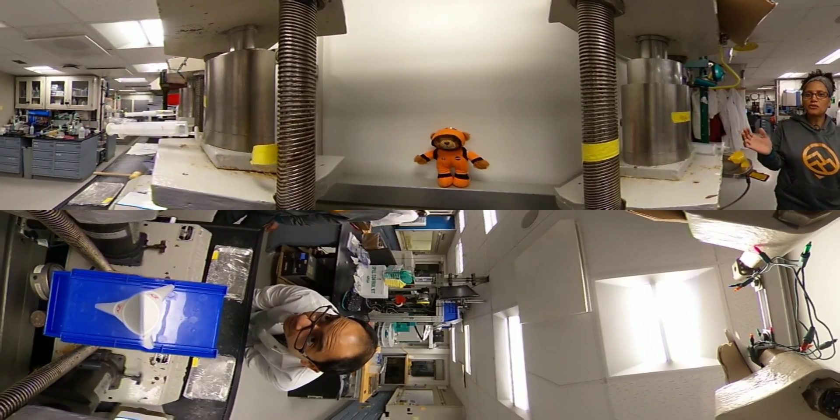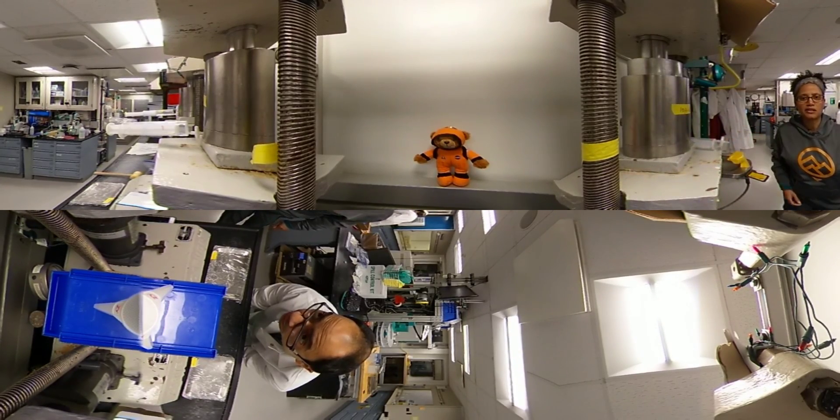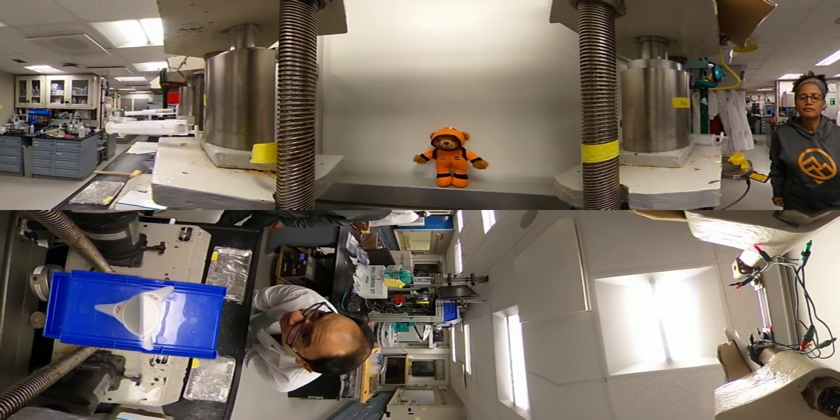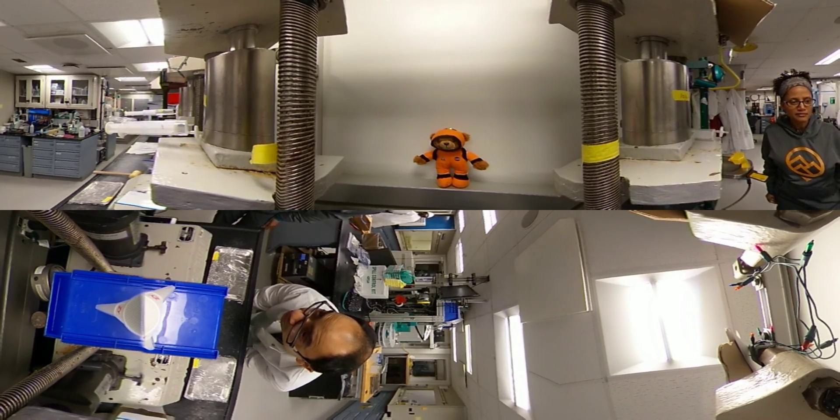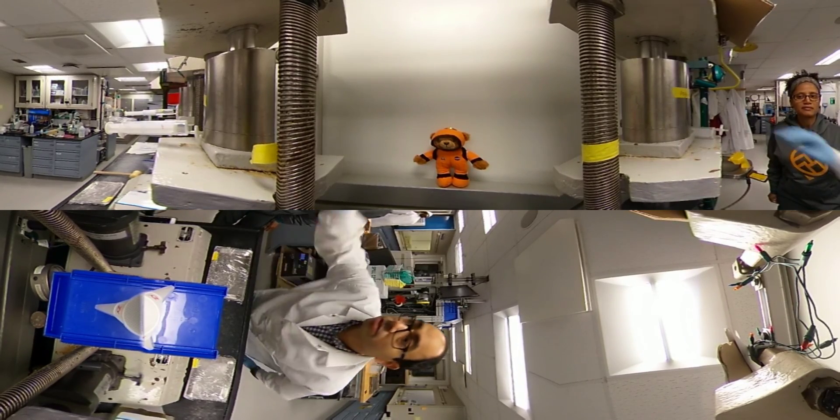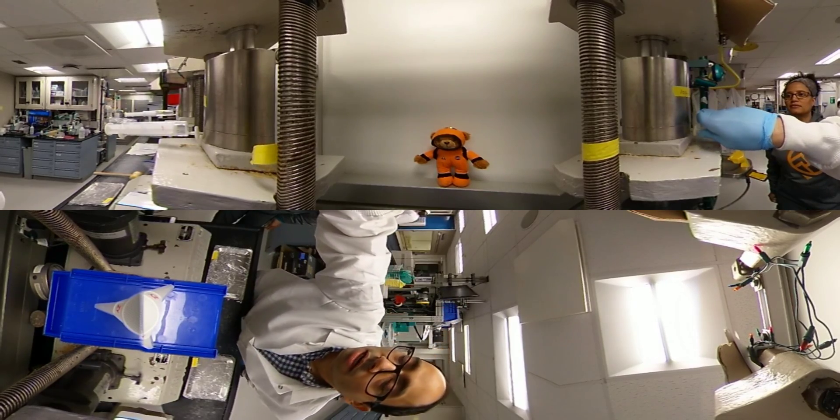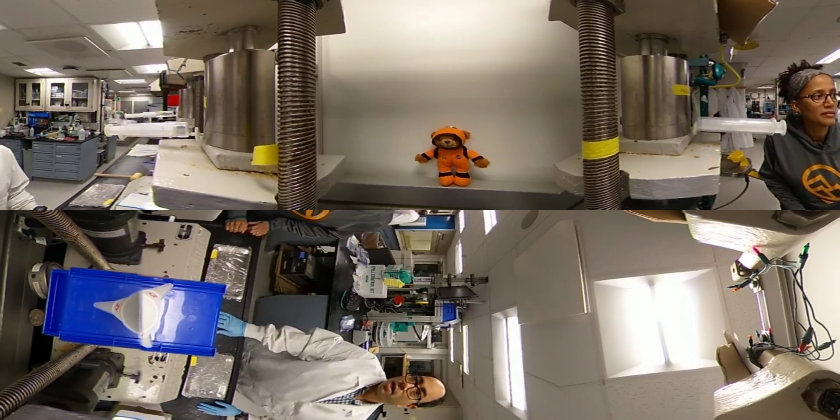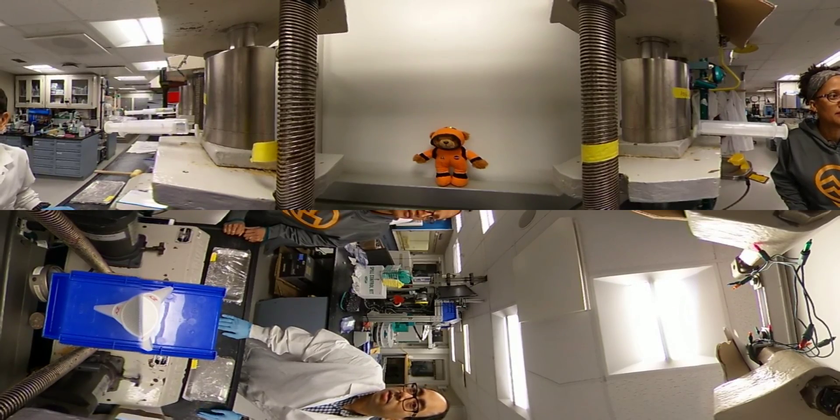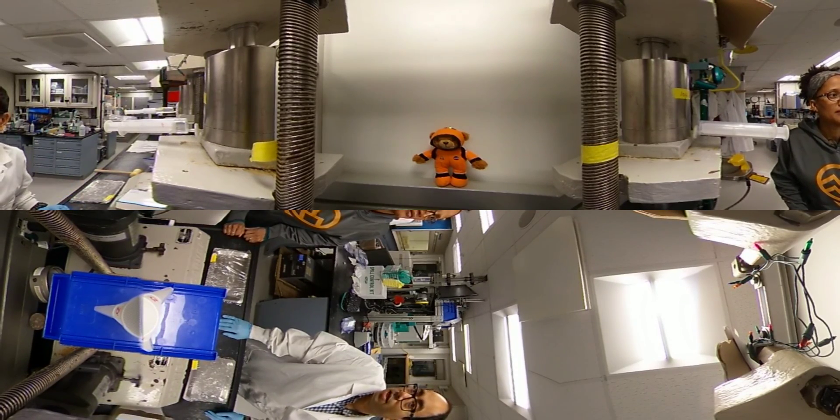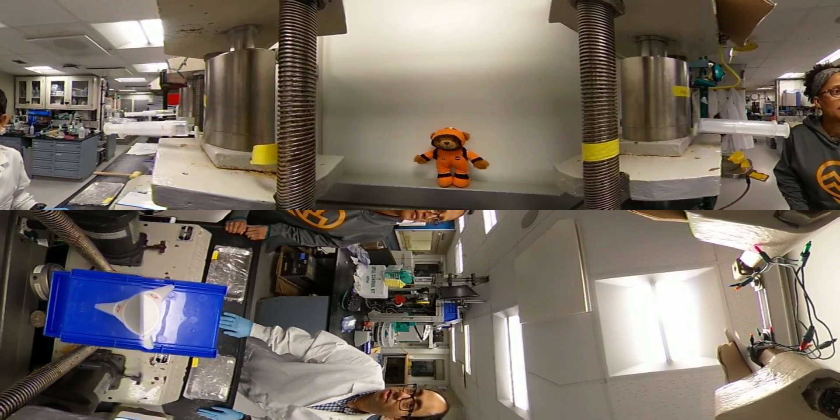What kind of analysis do you do on the water? We're going to measure the alkalinity, the salinity, and the pH. But we're also going to measure a lot of major and minor ions, cations and anions, using all the equipment available on board this vessel.